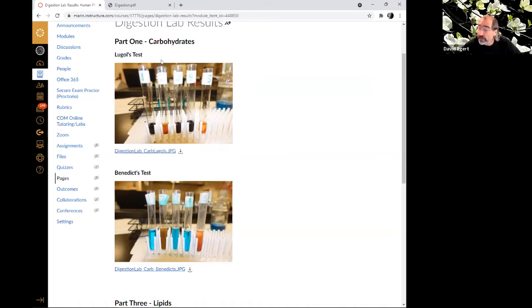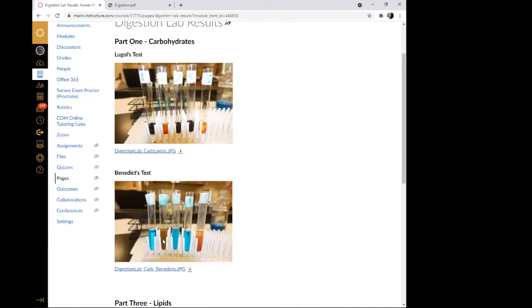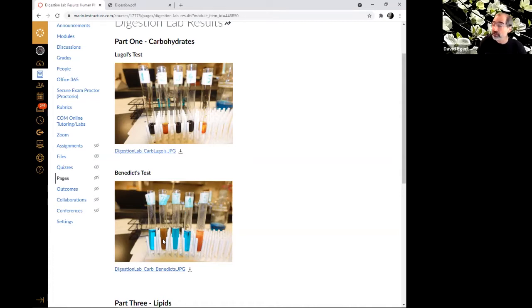Exactly, right? The fact that the Lugol's is staying yellow-brown means there's no more starch anymore. The fact that the Benedict's is turning this orangey color means there is maltose there. So that is evidence. So does this support your hypothesis or not? Yes. Yeah, it does. This is showing like, oh my God, Becky's spit actually took the starch and turned it into simpler sugars, right?